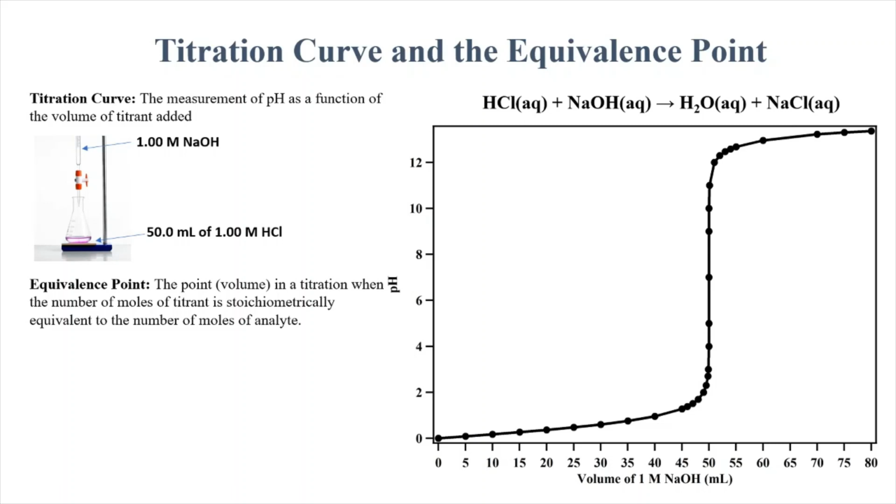When we collect a titration curve, we do the exact same thing as before, but we stick a pH probe into that solution. And what the pH probe does is, as we add volume, we can measure directly what the pH is. So in this case, we can see what's happening to the solution at all points along the adding of volume from the burette.